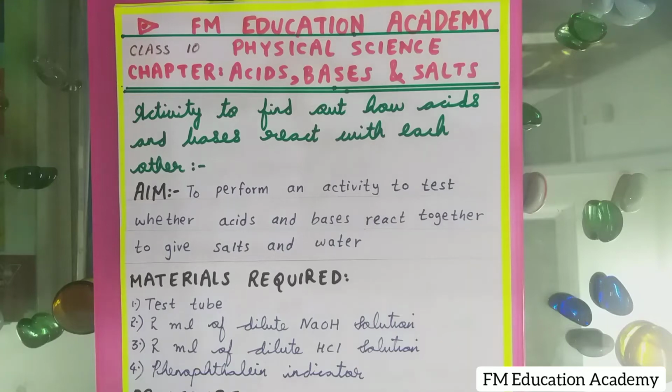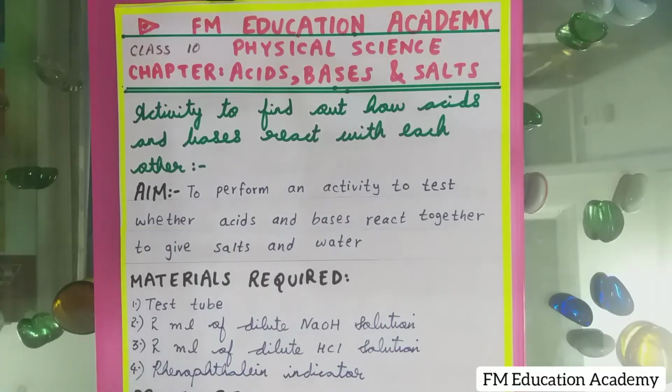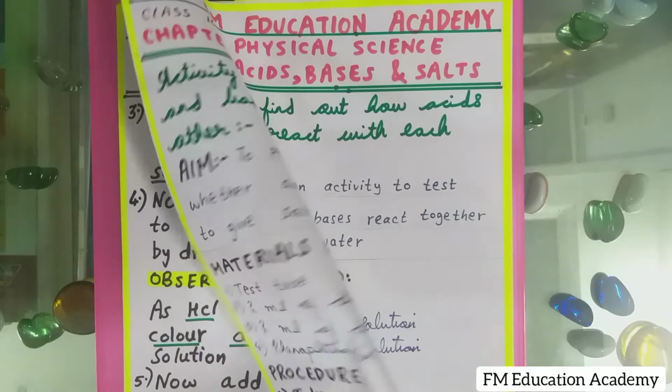In this video lecture, we are going to see an activity to show how acids and bases react together. That is, acid plus base will give me what? This reaction is very important because it is used in our day-to-day life. Now I'll show you what will happen when acid and base react together. I'll show step by step.